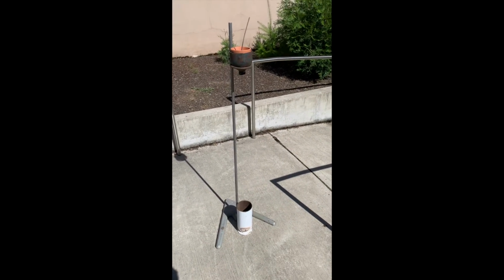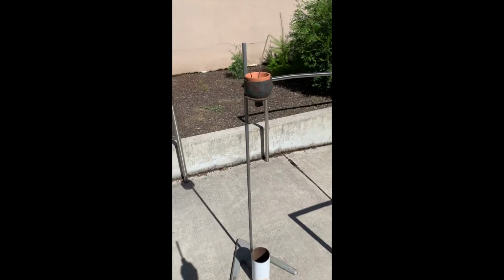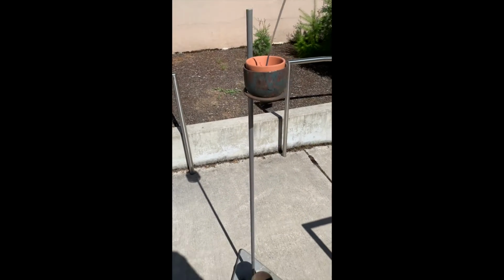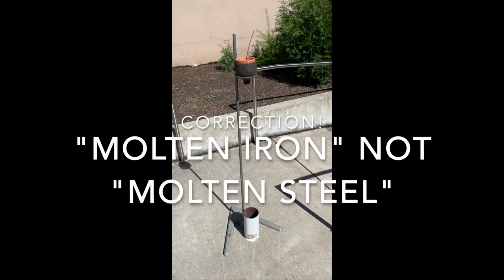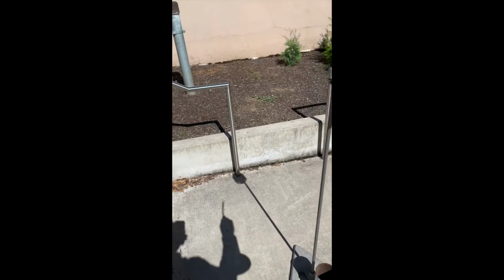Are we ready? Guess we'd better be. Remember, what you want to look at is the bottom here. That is where the molten iron and aluminum oxide will come pouring out. Let's do this.